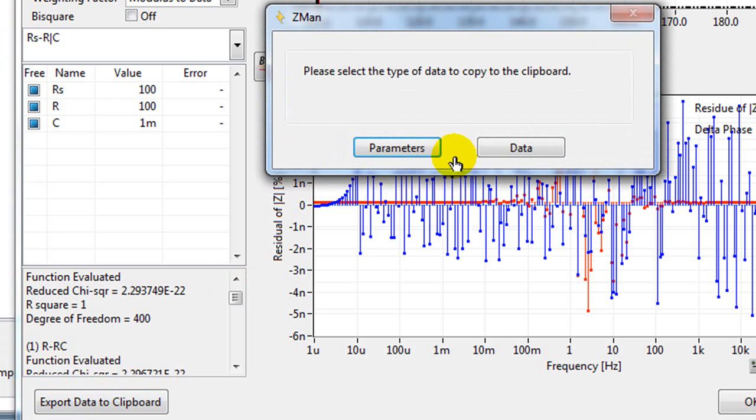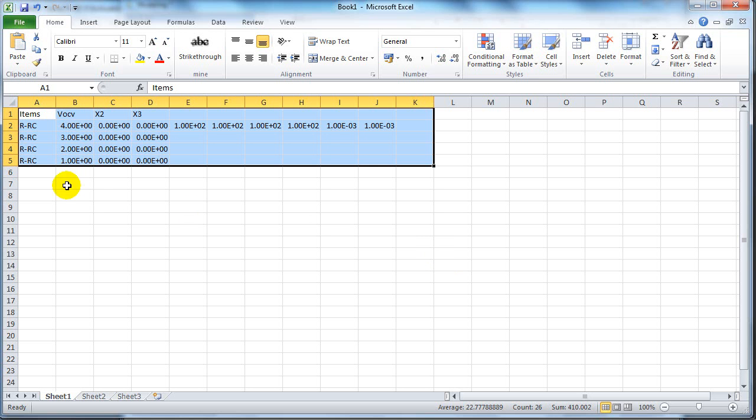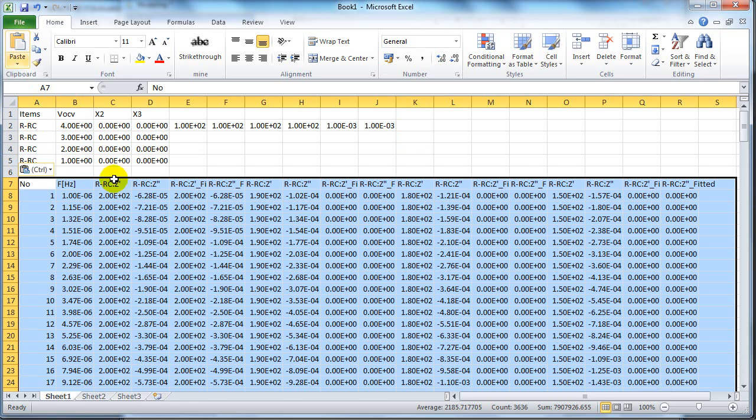If you export the data, this time choose data. You can paste that into Excel and that's all the data there.